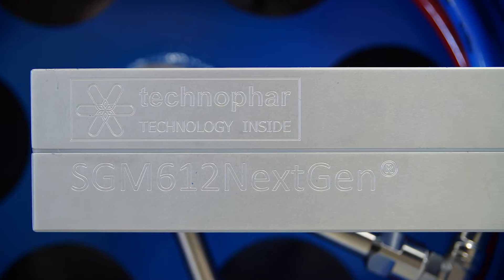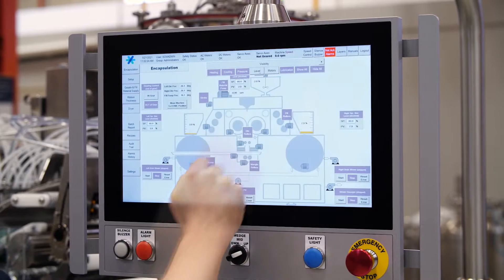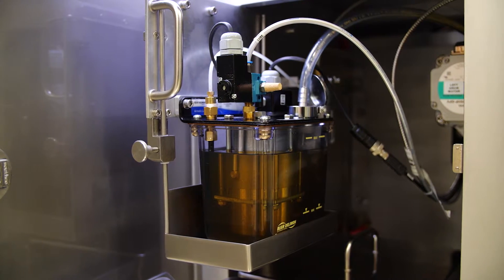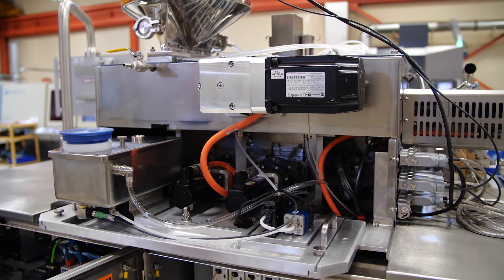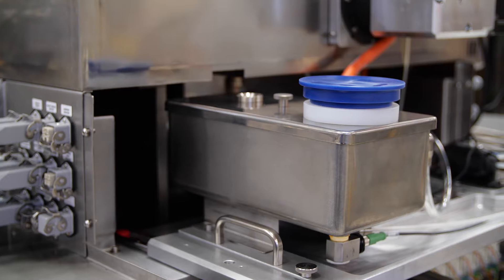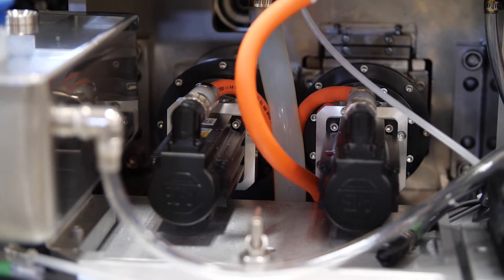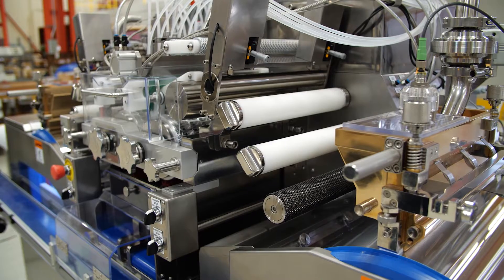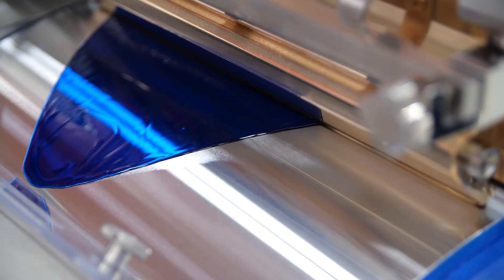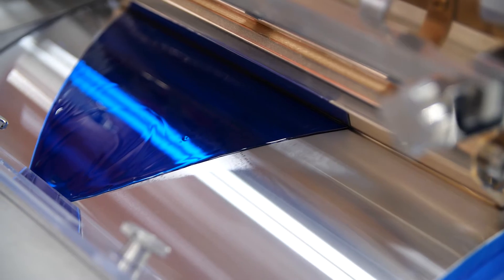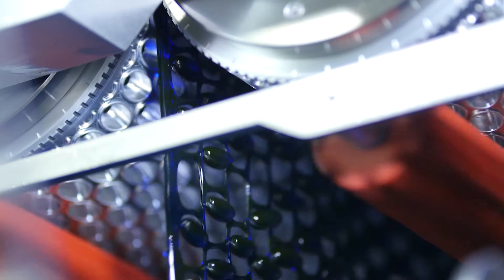Unique features on the new machine include CFR 21 Part 11 compliance software, multiple access doors with slide outs for ease of maintenance and operation for cooling system, pneumatic manifold, ribbon lubrication hopper, medicine pump slide lubrication hopper, high-precision micro dosing pumps for ribbon and medicine pump slide lubrication, optional ribbon thickness monitoring system for quicker startups, reduced gelatin consumption, and better soft gel capsule quality.